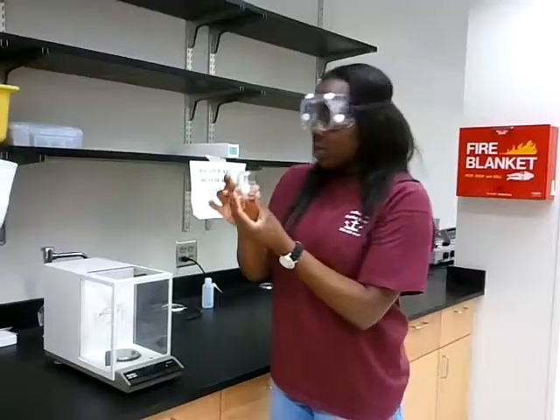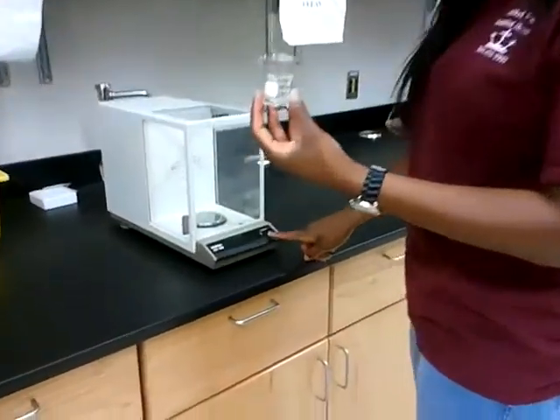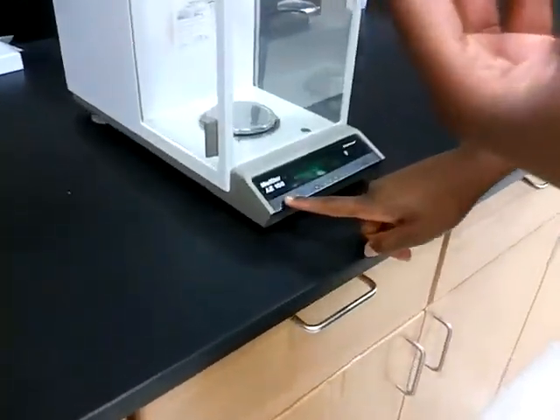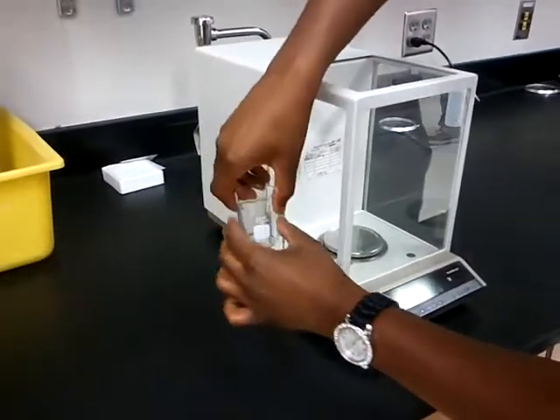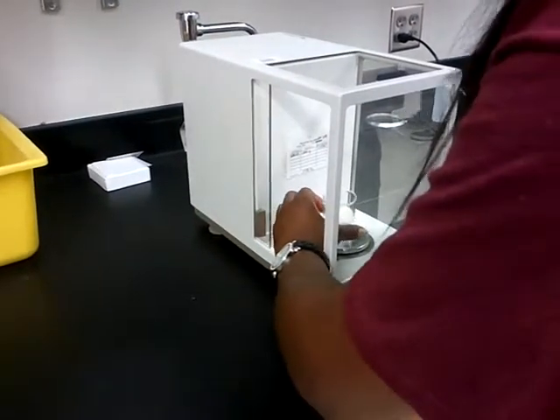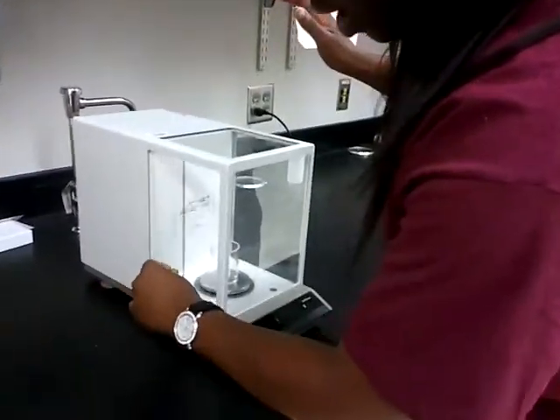Okay, before we start measuring any of the liquids, we want to take the initial mass of our beaker. We'll use that to get our calculations later. So what we do is come over to our analytical balance, make sure we turn it on, and zero it out. We'll open our door here. Be sure that your beaker is empty and dry of any excess liquid.